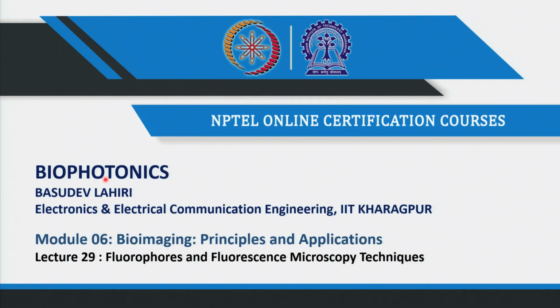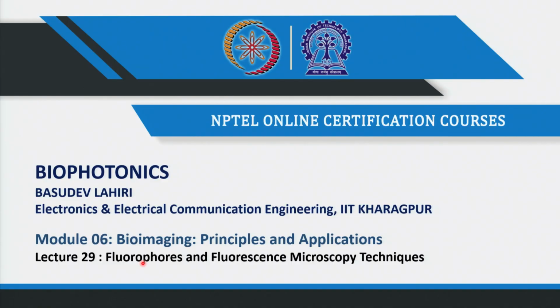So, today's class, I am going to discuss fluorophores and fluorescence microscopy techniques. This is also going to be quick because I believe the fluorescence part was already discussed. I assume you now know what fluorescence is, and a little bit of fluorescence microscopy has also been discussed. So, let us go on with it. We are mostly going to discuss a little bit about fluorophores.